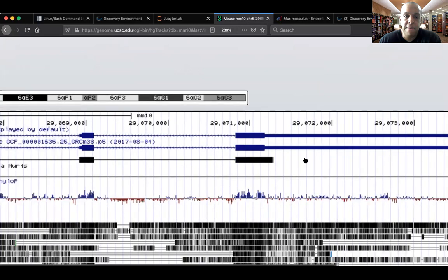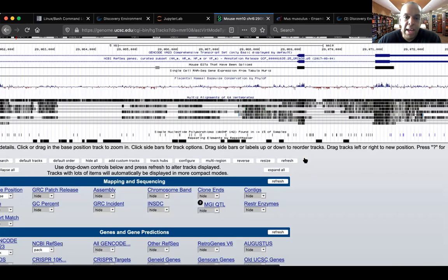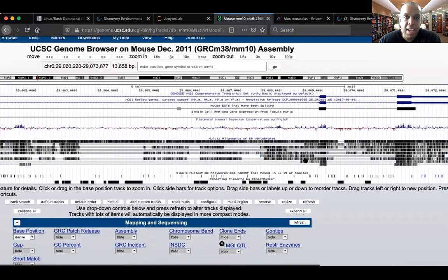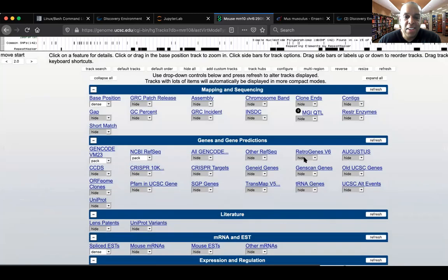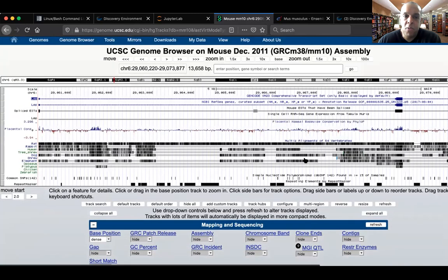There's a lot of detail here, much more than I can really explain in even a couple of hours, let alone a few minutes of a lesson. But we can view our data in context, and I'm going to show you how. And the great thing is if you do a different experiment, different data, hopefully this is a guide that shows you how to incorporate some of that.